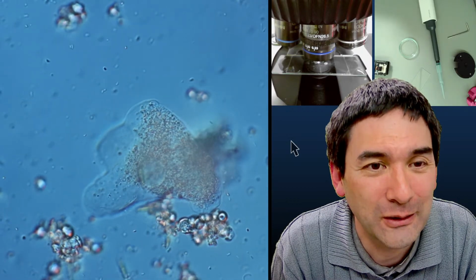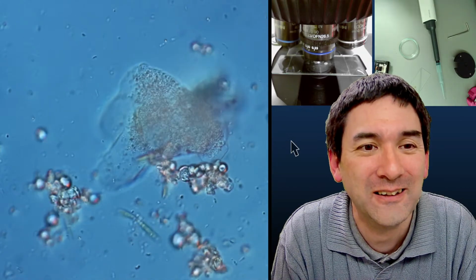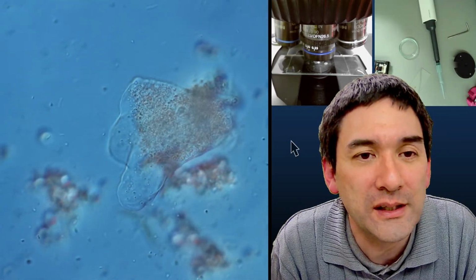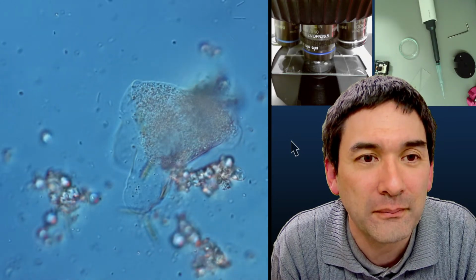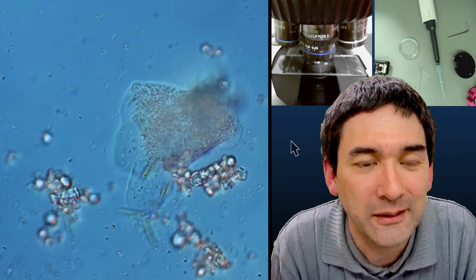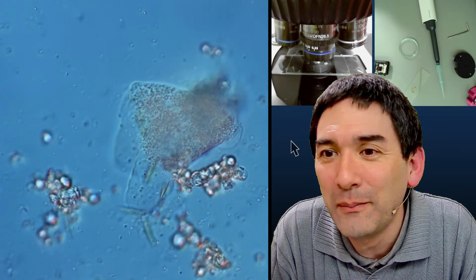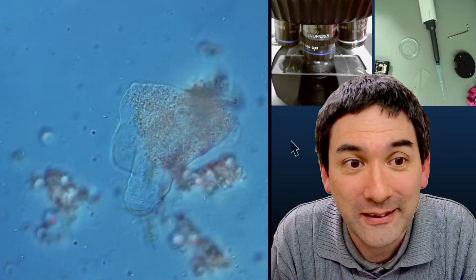There was maybe a little too much pressure on the cell. I actually thought it might start to regenerate, but if you look into the cell, the cell organelles inside are not moving anymore. Let's wait a little bit. Now the bacteria are going to be happy because they found some food. Okay, well done on the amoeba resurrection. Well, I don't know if I resurrected it. I don't know.